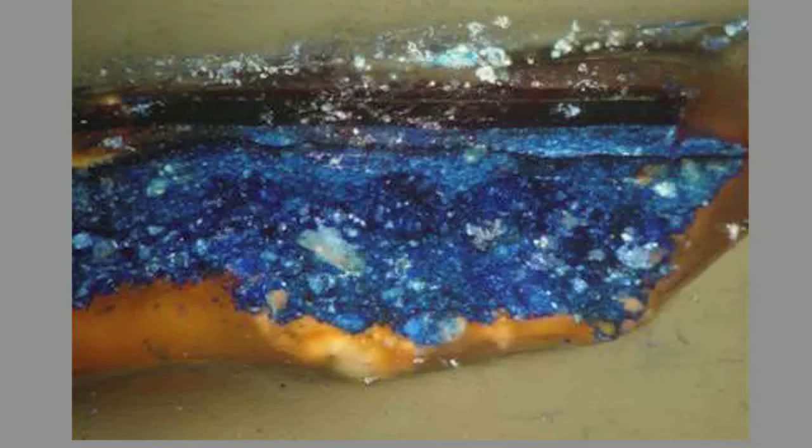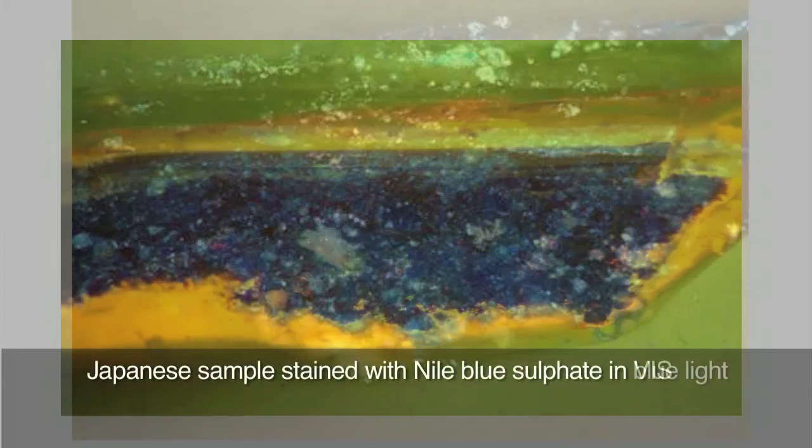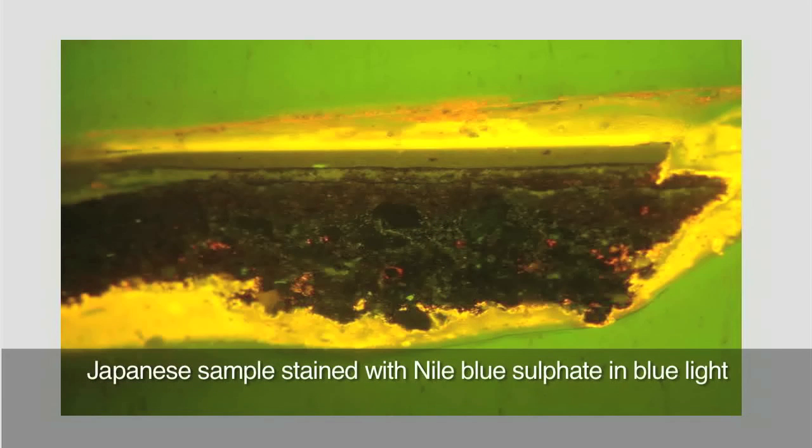A second method of staining oils is using Nile Blue Sulfate. The staining procedure is similar to that of Sudan Black, but Nile Blue has the advantage of producing staining results which are often better visible. Also, the staining solution does not interfere so much with the coating agents that may have been used to protect the sample from resin infiltration during embedding.